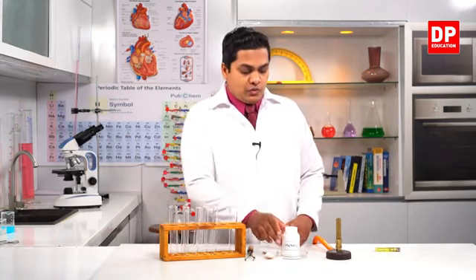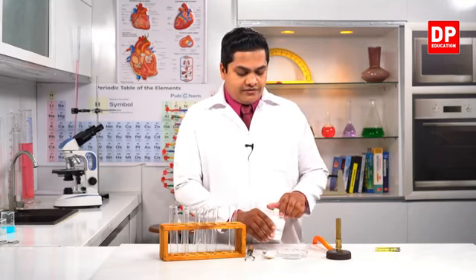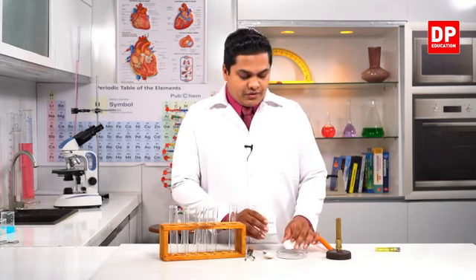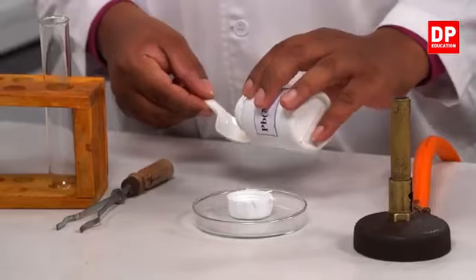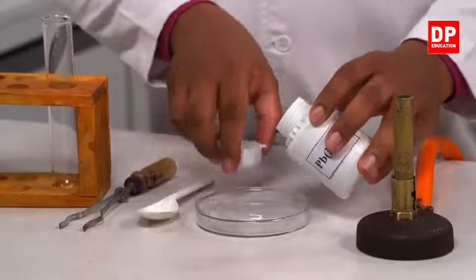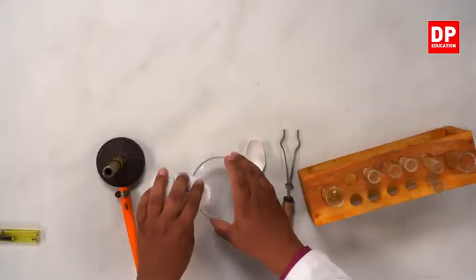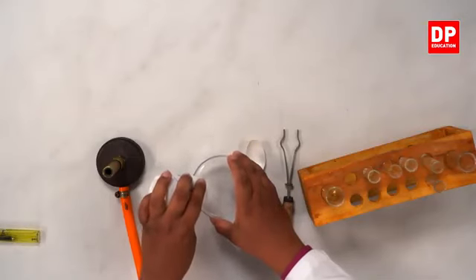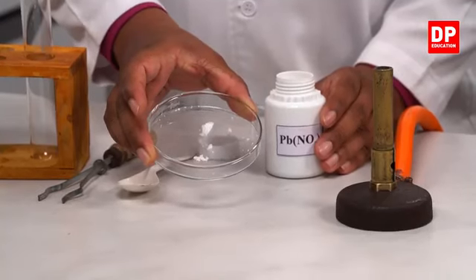So I'm going to use some amount of lead nitrate first. I'll show the nature of lead nitrate. See, this is a white color powder, lead nitrate.